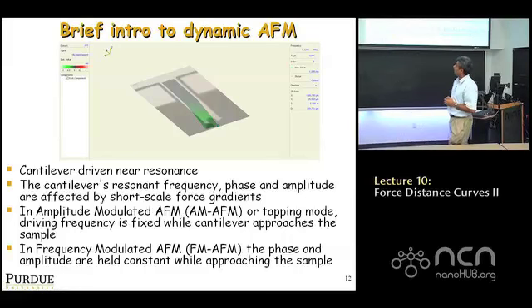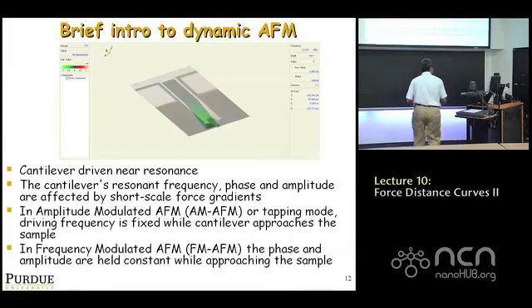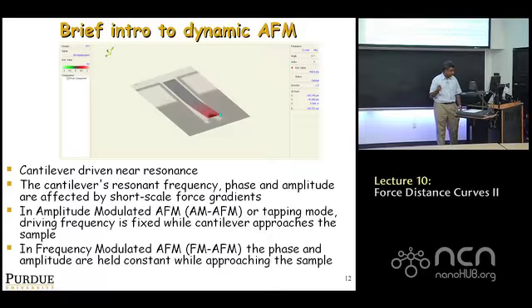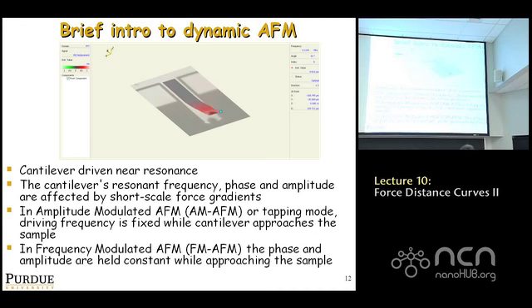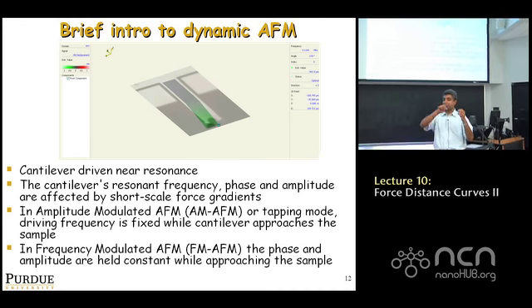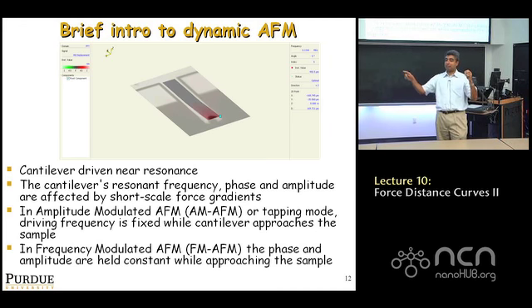However, what ends up happening if you take an AFM cantilever and start shaking it? This is an experimental measurement of how this thing moves up and down. Every cantilever has a resonance frequency and multiple resonance frequencies, just like a guitar string has a first eigenmode that goes like that.